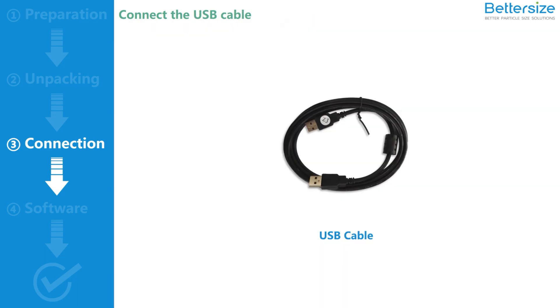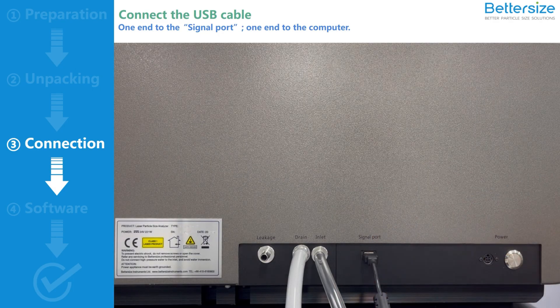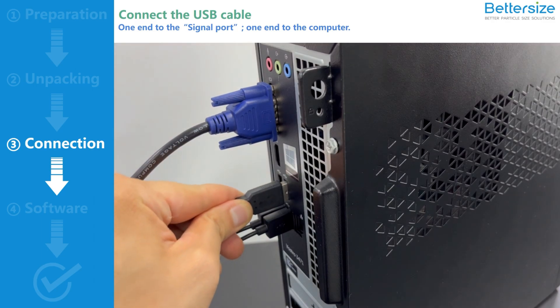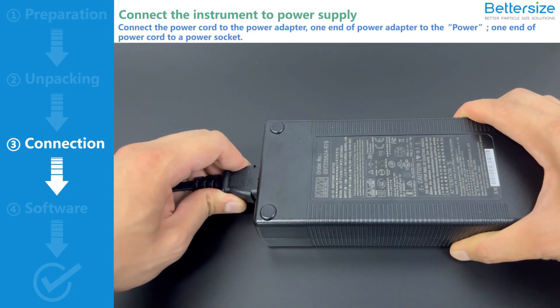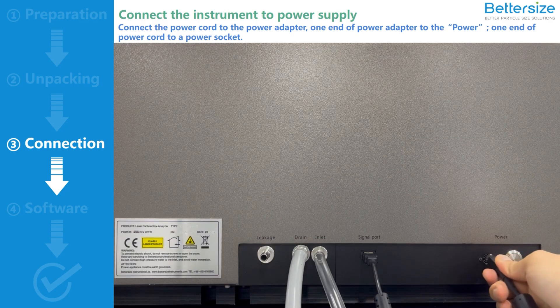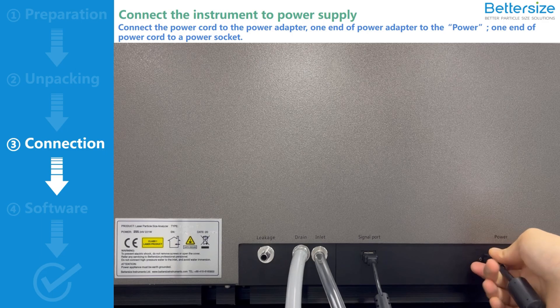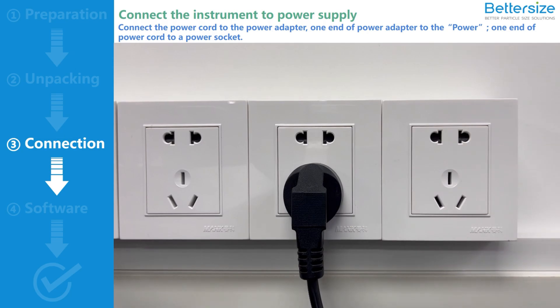Next, connect the USB cable. Connect one end to the signal port of the Bettersizer ST, and connect the other end to the computer. Next, connect the instrument to the power supply. For the operation of the Bettersizer ST, a power adapter is necessary. Connect the power cord to the power adapter. Connect one end of the power adapter to the power port of the Bettersizer ST, and connect one end of the power cord to the power socket. Now the connection of the Bettersizer ST is completed.